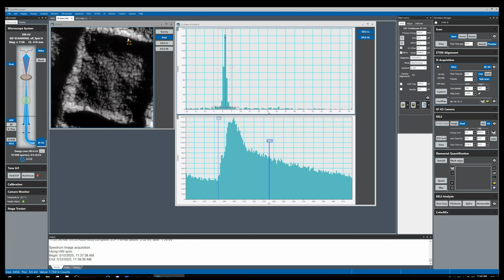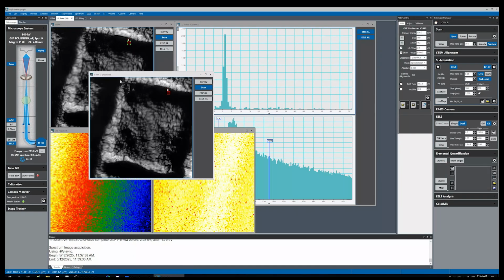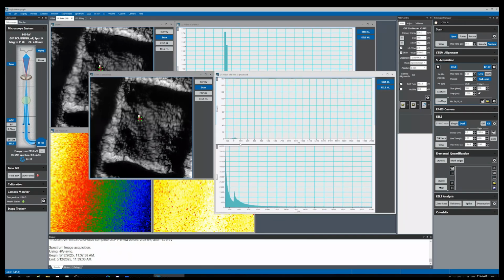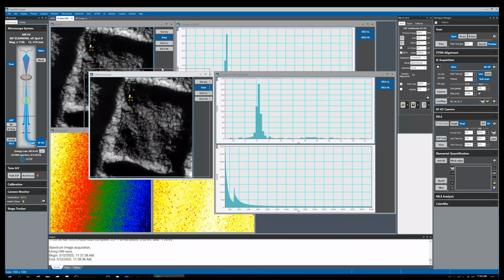To do that, we drag our mouse on it and make an ROI, and we can go to SI and select align SI by peak. Okay, yes. Alright, so now we get a STEM SI processed. Now if we drag this ROI, let's zoom in to the zero loss region. See, when we drag our ROI, now the zero loss stays all the time at the zero position.